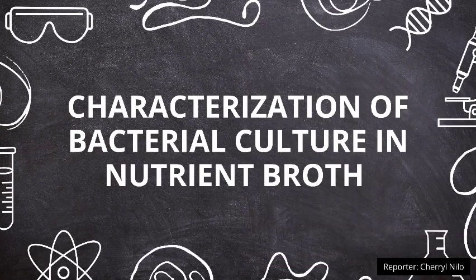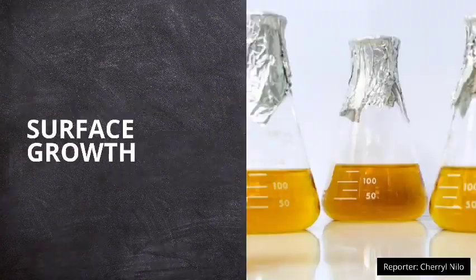Now, let me discuss the characterization of bacterial culture in nutrient broth. First is the surface growth. These growth patterns can be characteristic of an organism and may be used to aid in identifying an unknown organism. However, you must be careful when using growth patterns in broth to identify an organism because the type of broth and the temperature at which the organism is grown can alter the growth patterns. Also, if something happens to shake or otherwise disturb the tube, the growth pattern may be disrupted and subsequent observation will yield erroneous results.